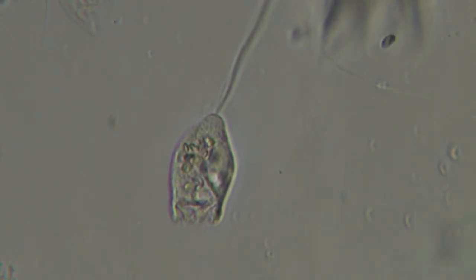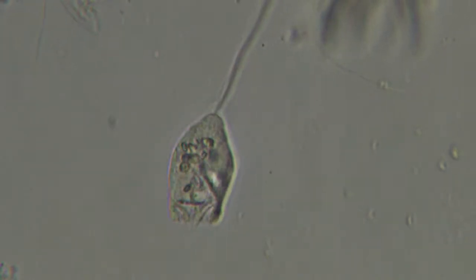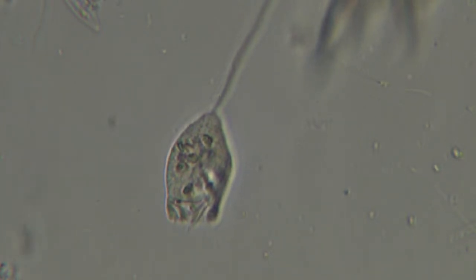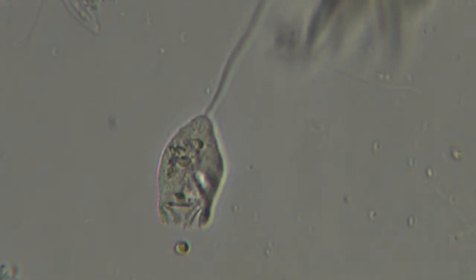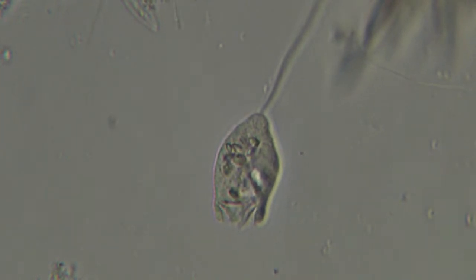One of these days I'll put my phase contrast optics on here, so this stuff will really pop. I keep forgetting to do it. And it's kind of a chore because you have to change the objectives, you have to change the stuff for the condenser. And so it's not a 2-minute operation. And once you install it, you're stuck with phase contrast until you undo all that. And some things just don't look good in phase contrast.